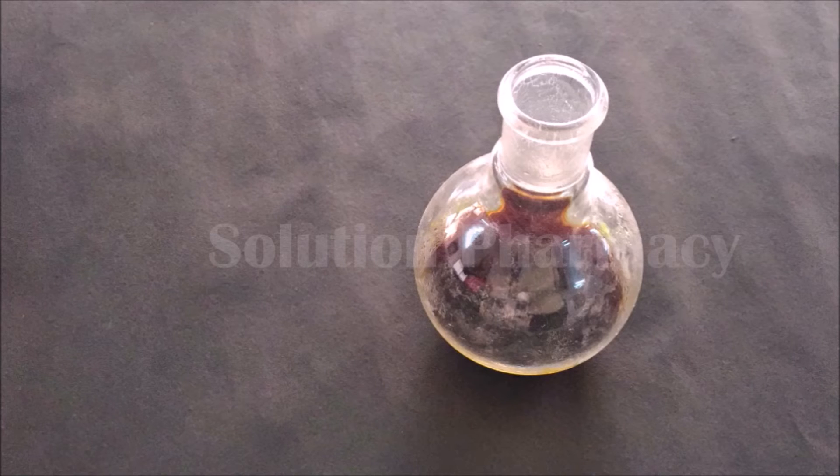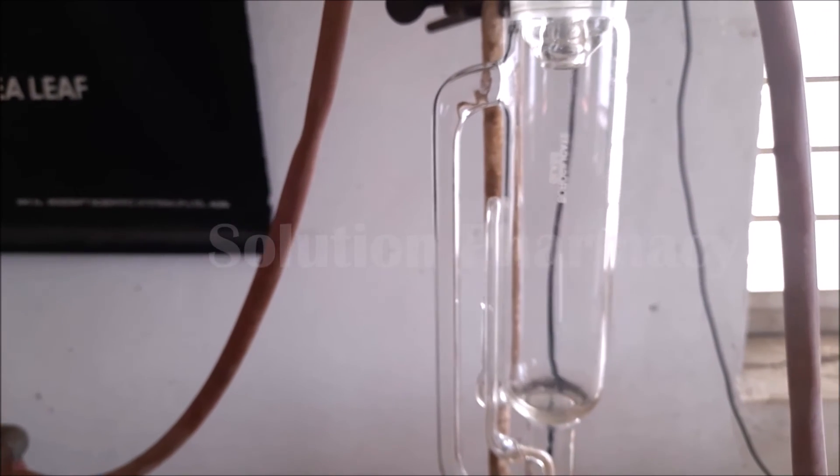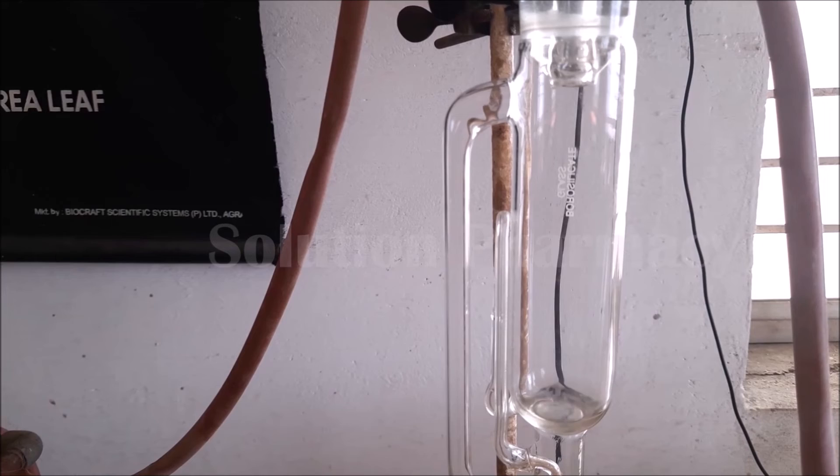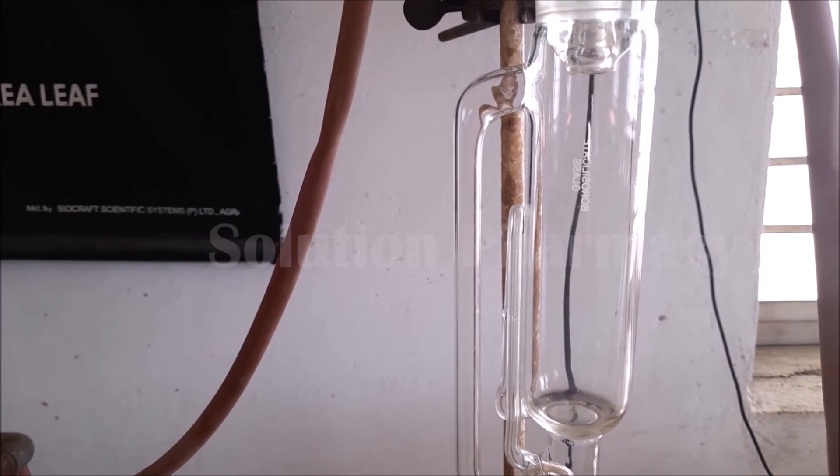Next we have to concentrate this liquid extract by evaporating the solvent. If we directly evaporate the solvent on a heating mantle, water bath, or hot plate in an open vessel, there will be loss of solvent into the air. If we want to prevent this solvent loss and recover the solvent vaporizing during concentration of the extract, it is possible by using the same Soxhlet assembly. We can recover the solvent very easily. For this, set up the Soxhlet assembly as before but this time keep the Soxhlet extractor empty.